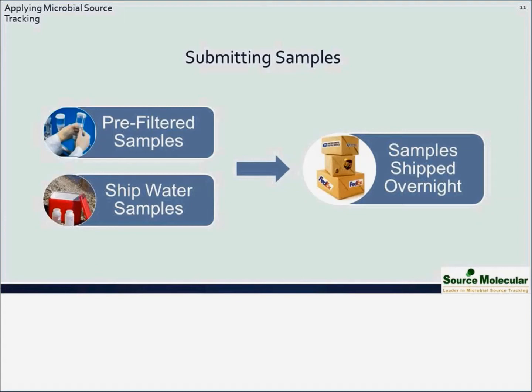And so you can go in and cherry pick which samples are going to provide you the best insight in terms of high levels of bacteria. So you say, okay, we realize these 4 sites this year were impaired. Let's take those 4 sites every collection event and send them for analysis. And let's figure out what's going on there. So it frees you from having to send continuously the water samples and enables you to go back and determine which samples you're going to analyze with the source tracking markers.